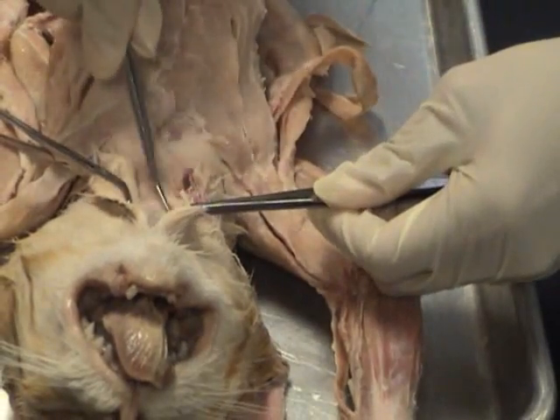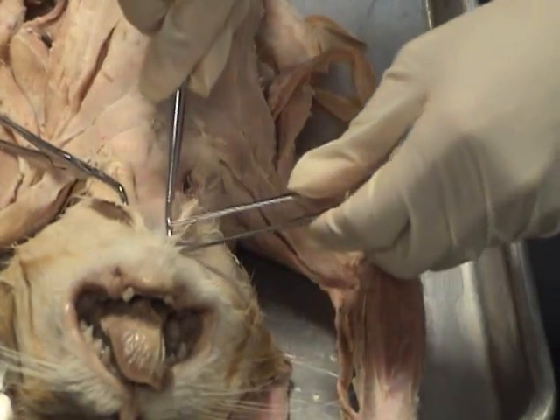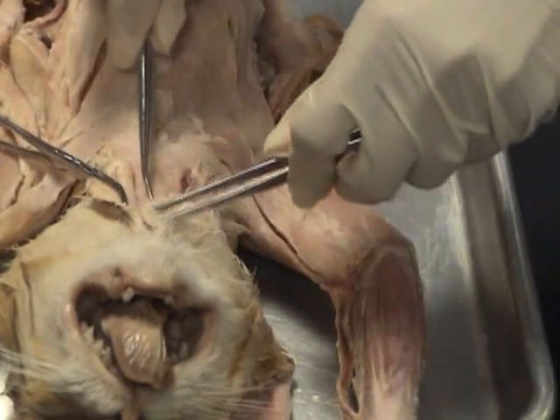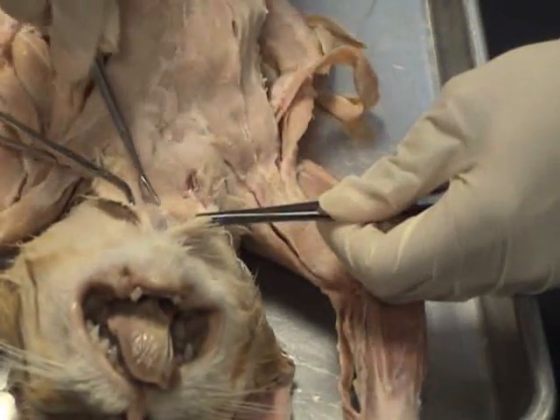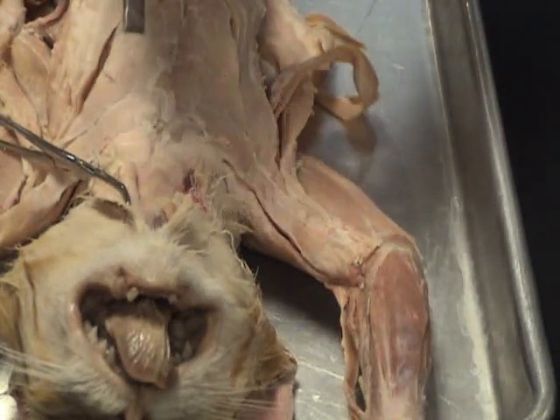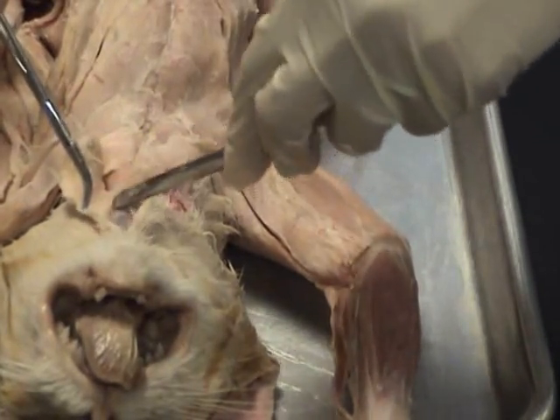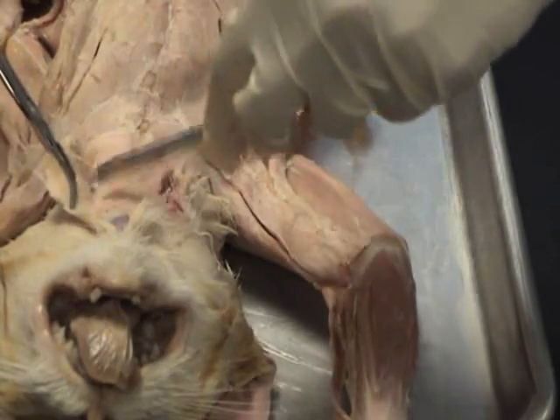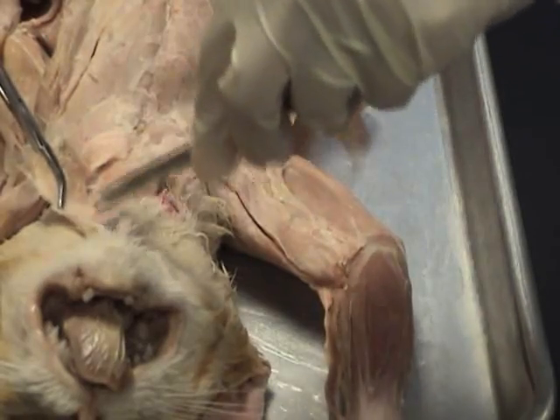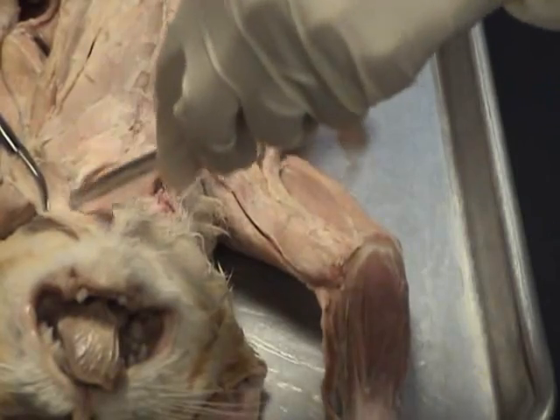Remember, we're trying to stay very superficial, because the deeper you go, the higher your chances of running into muscles that you want to learn. So doing this, you're going to cut the connective tissue, but not damage the muscle of interest. You can also use the other side of the probe, which is the flat side, and do the same thing, cutting through connective tissue. This is usually the technique that we want you to use. Remember, do not use a scalpel unless it's the last resort.